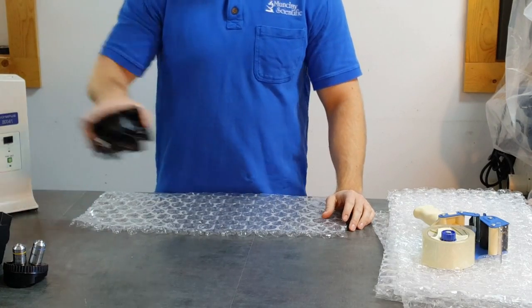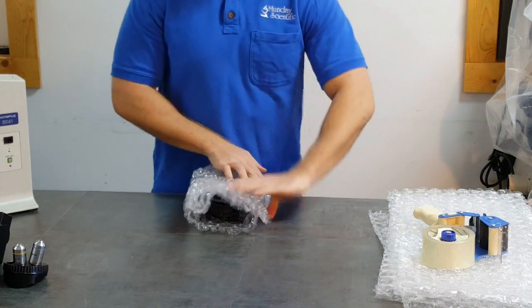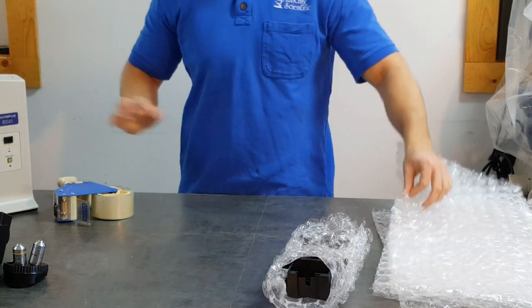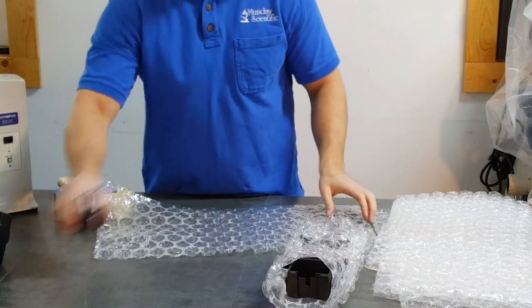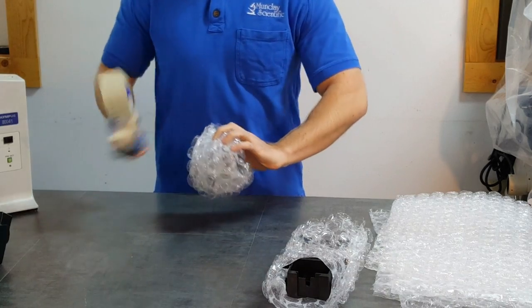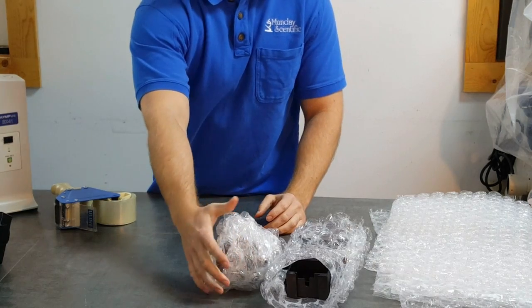Disassembly is complete. Now onto the packing portion. Take the sub-stage condenser and the condenser, wrap them individually, tape them, and set them to the side.